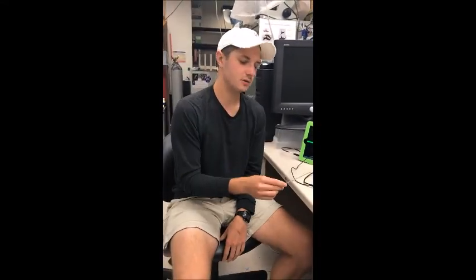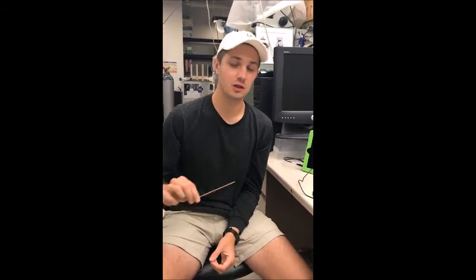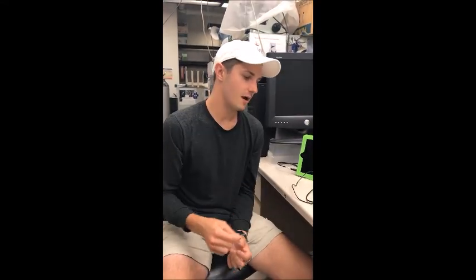This can also be done with a lobster prep. With the lobster, even though they have a bigger claw, you might have to push a little harder, and they do have a lot more hairs, so you should get more of a stimulant on the nerve. But you need to be careful with the claws and probably leave the rubber band on them because they are more dangerous than the crayfish, and they will bleed some more, so you might need to add a little bit more glue or the clay as we showed earlier.